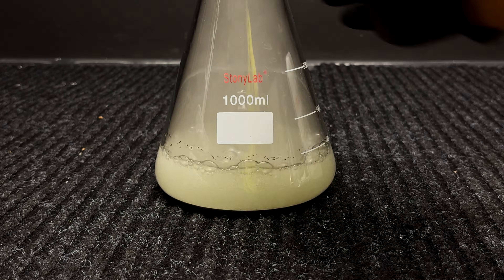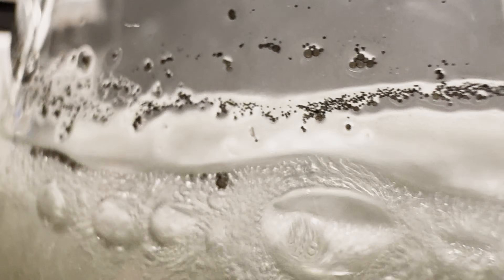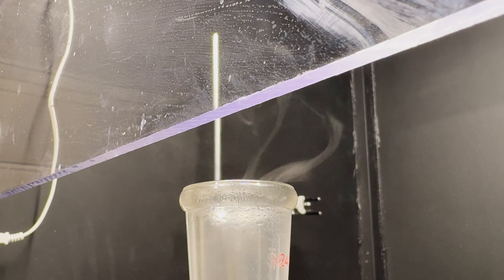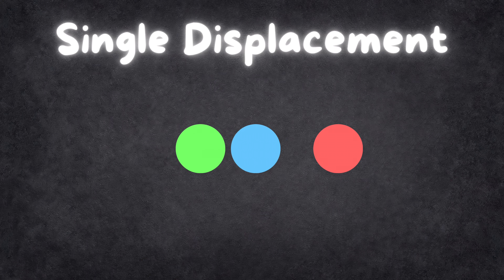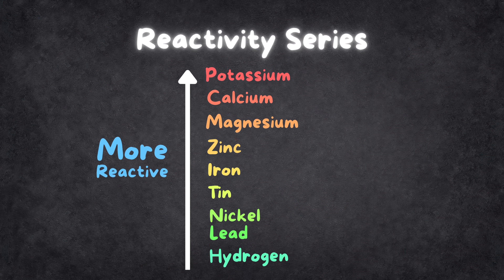Step 3: reacting. Immediately after adding in the HCl solution, the Erlenmeyer flask starts bubbling violently and heating up. If you look closely, the solution begins developing a green tint, indicating the production of green iron(II) chloride. A lot of acid vapors are also released — you really don't want to breathe them in. The reaction, although simple, is one I really like because of how beautiful it looks. This is a great example of a single displacement reaction: solid iron powder displaces hydrogen from hydrochloric acid, forming ferrous chloride and releasing hydrogen gas, because iron is above hydrogen in the reactivity series.